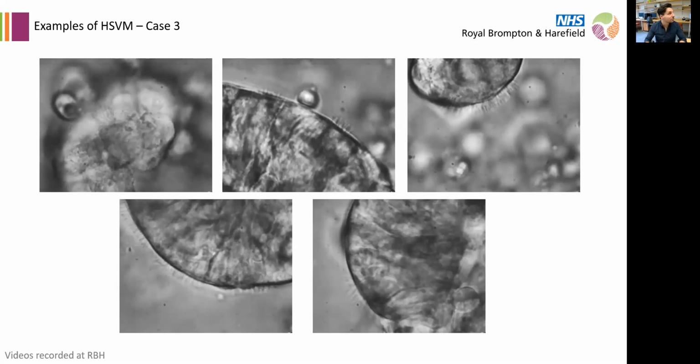Okay, next patient. So it's a little bit trickier. It's actually not completely immotile. I can highlight some areas where it's slightly moving. We have some slight movement here. We can see here that some cells are actually missing cilia completely. So once again, no real question here.